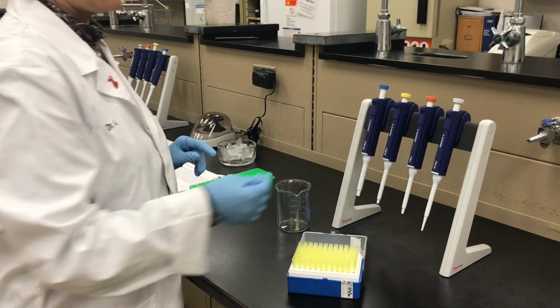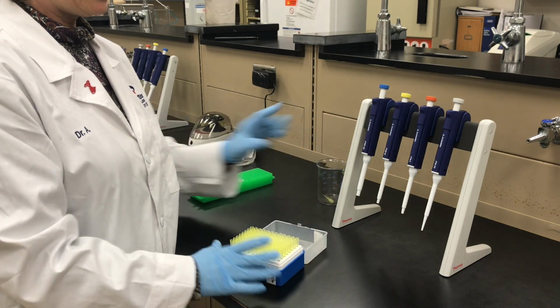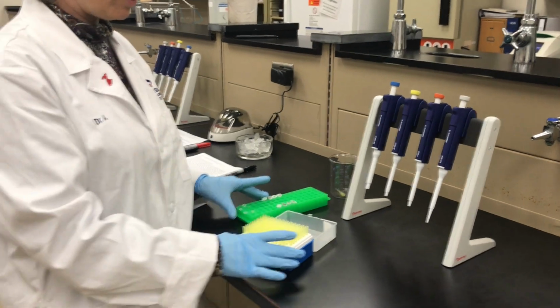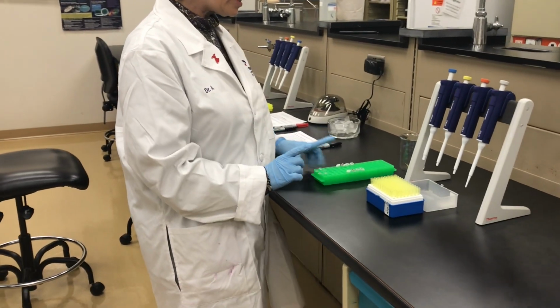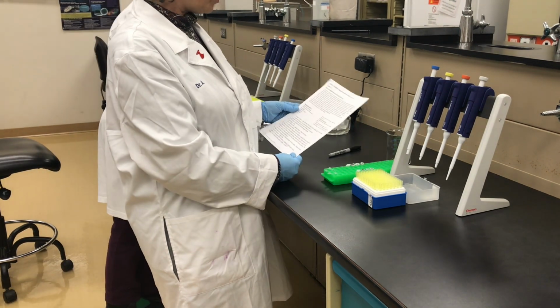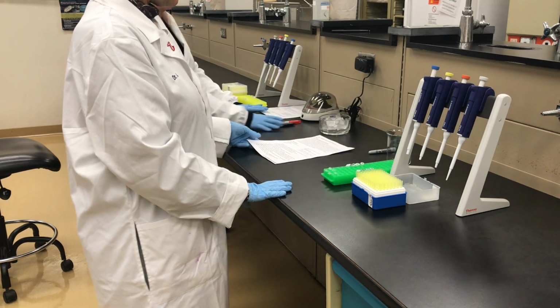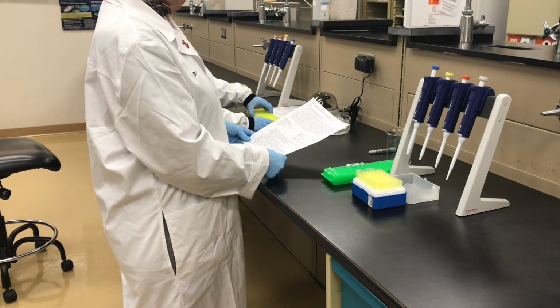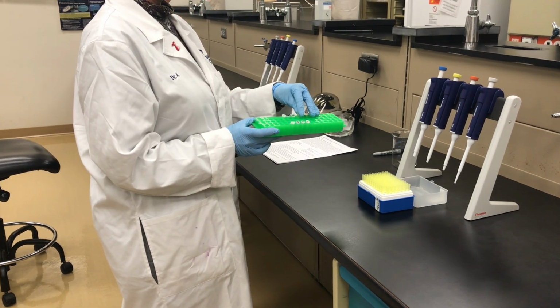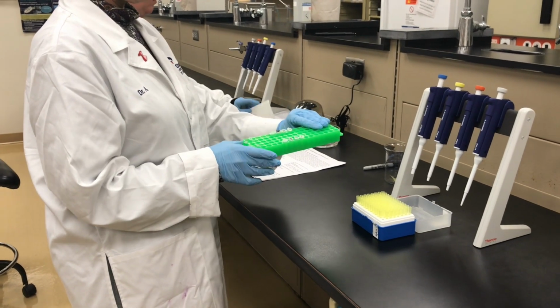And now that I've walked you through the pipettes, Dr. Cheney and I are going to set up PCR reactions, and you get to watch since you don't get to do them yourself. So we're going to be looking at the student protocol, which hopefully you printed and read already. These are called Eppendorf tubes, these little tubes, Eppendorf racks. These you can actually get on Amazon.